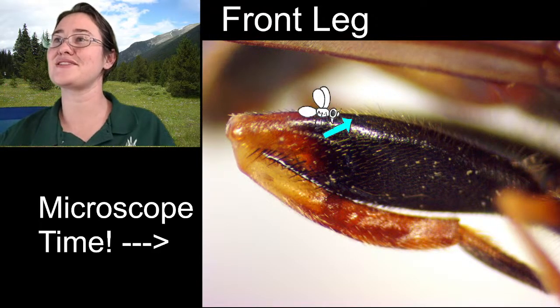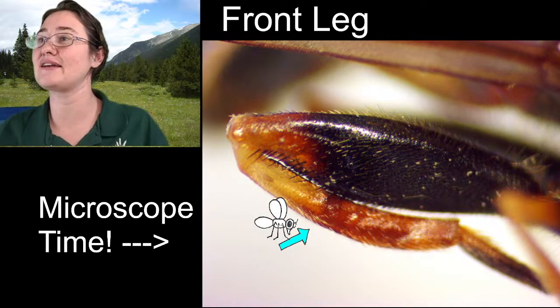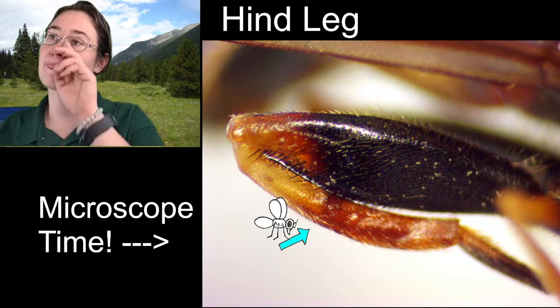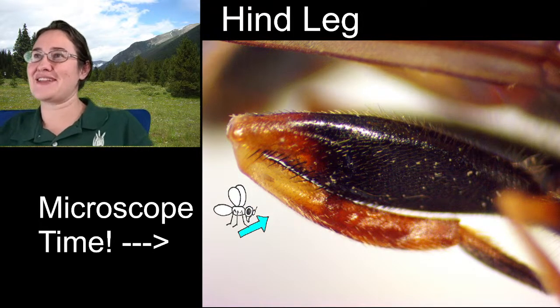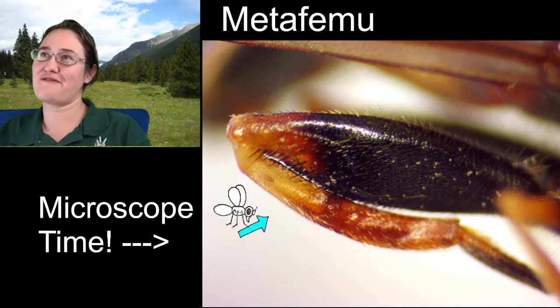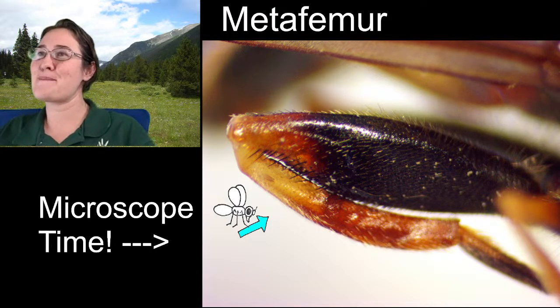And that is the femur and the tibia of the hind leg. Or, if you wanted to get really fancy, this is the metafemur. And the metatibia, because they're on the last leg.